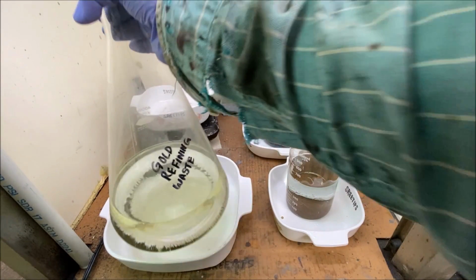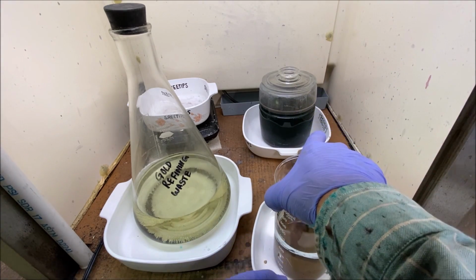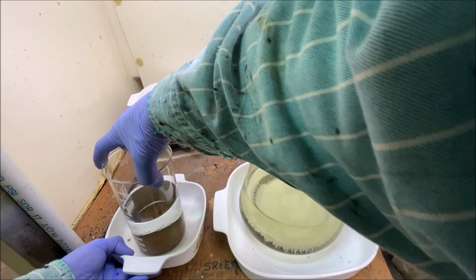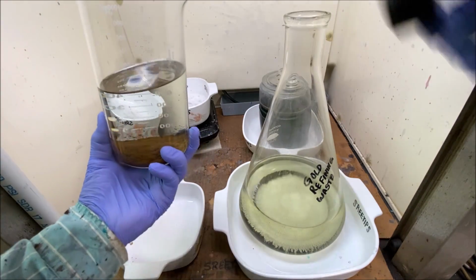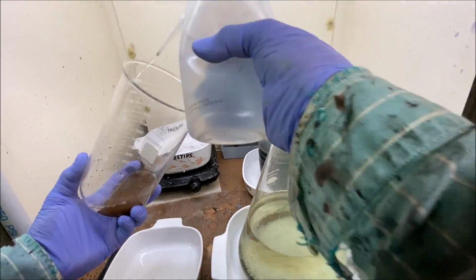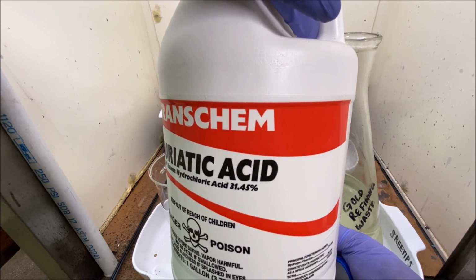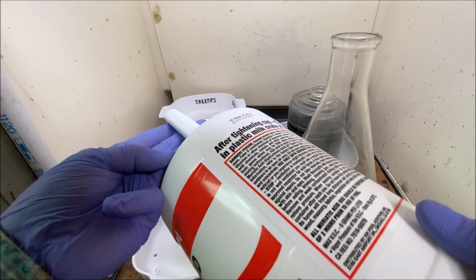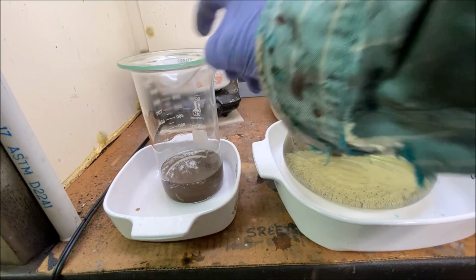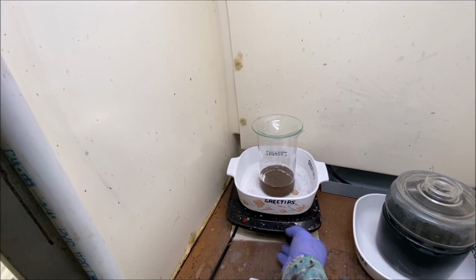Now what we'll do is we'll take a look at this ounce of pure gold that I have in this container right here. I've done a single refining on this gold in here. I'm going to pour this waste off. So what I'm going to do is add some hydrochloric acid to the gold in this beaker, take it up to about the 300 milliliter level. Okay, now we'll cover this up. I'm just going to boil the refined gold in some hydrochloric acid.